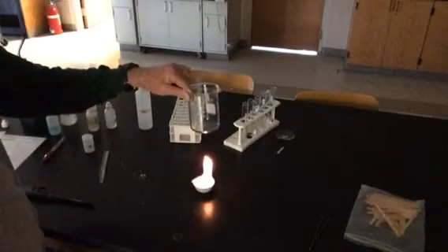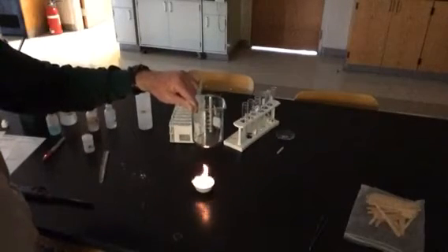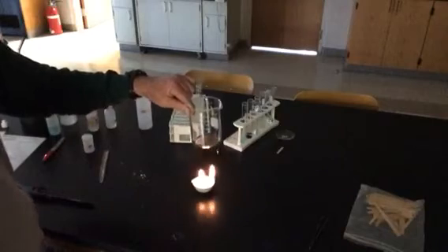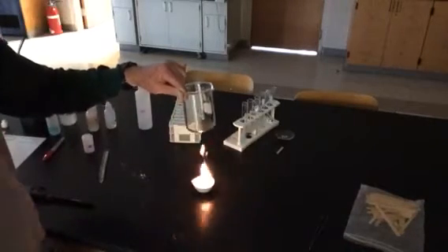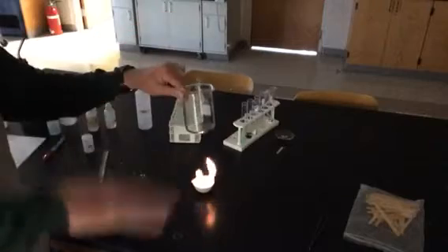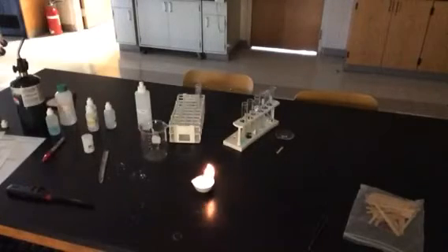But one of the things that gets produced by these kind of reactions is water. So I'm trying to see if I can get some evidence of some moisture on the bottom of my beaker as this reacts. It's going to be kind of tough to do that because the air is pretty dry. And so whatever moisture is being produced from the chemical reaction here is going to quickly evaporate into the air. Let me see if I can do this.